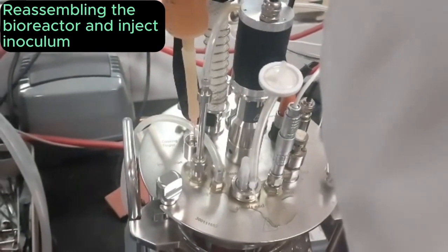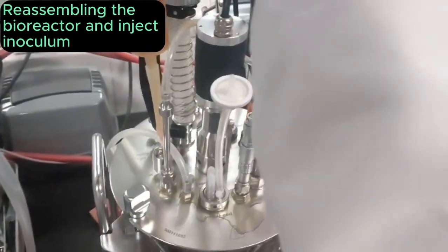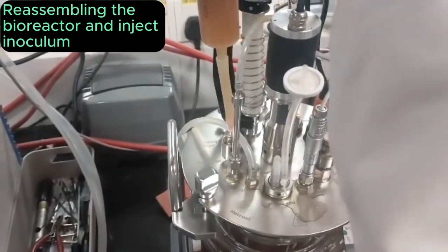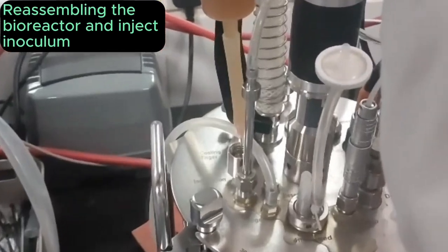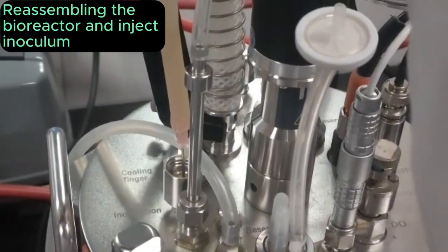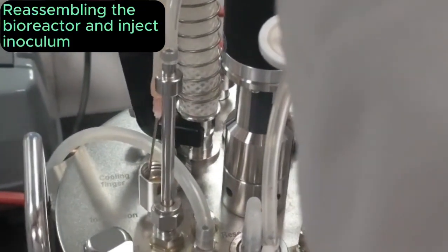After the injection of inoculum, the time starts to count. And then we need to take the sample based on the interval time to conduct 3 analyses. The first one is the absorbance reading by using UV spectrophotometer, while the second one is the absorbance reading by DNS method. The last one is the gas chromatography method. These 3 methods help us to determine the yeast growth during this 24 hours interval.